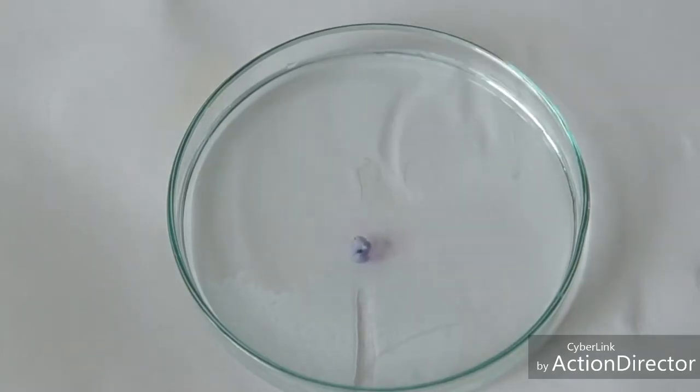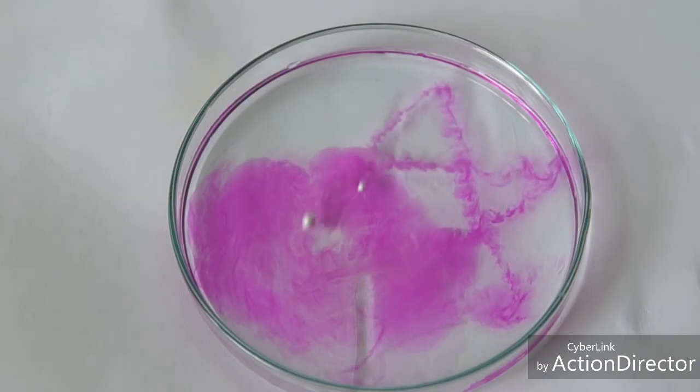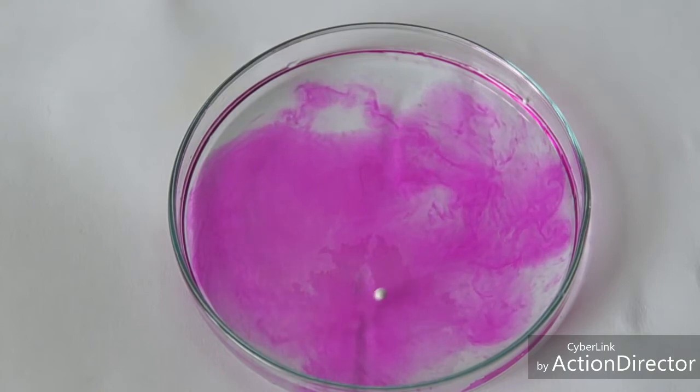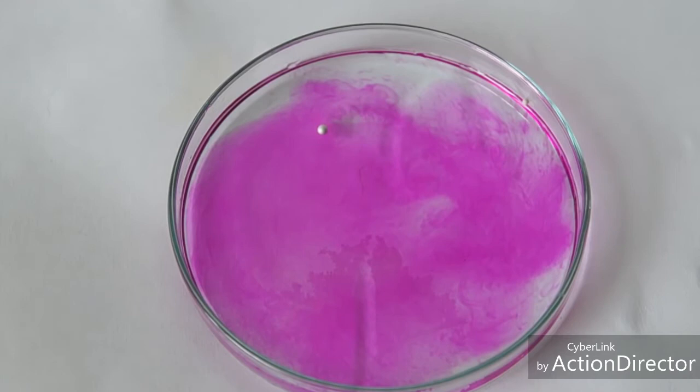Take a small piece of sodium and put it in water. By the way, the indicator phenolphthalein was added to the water. As a result of the reaction of sodium with water, sodium hydroxide and hydrogen are formed.